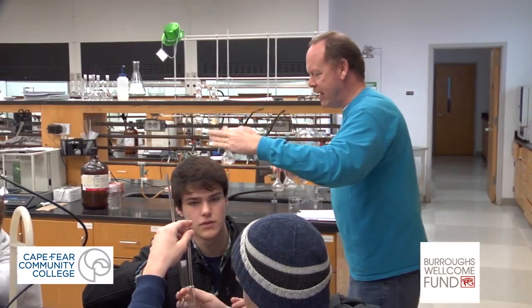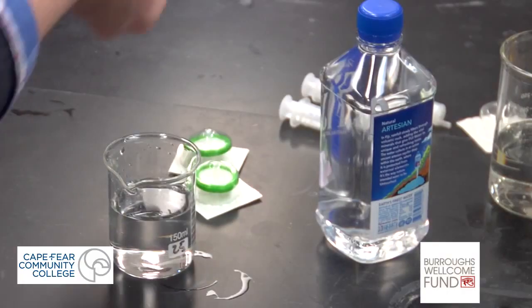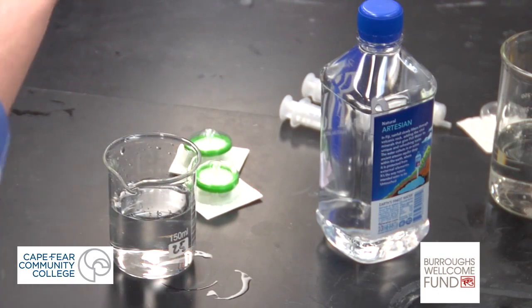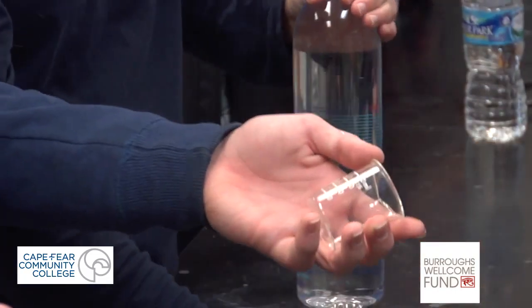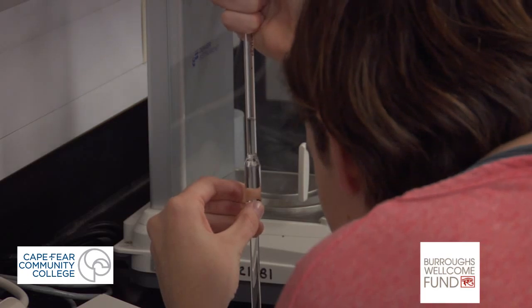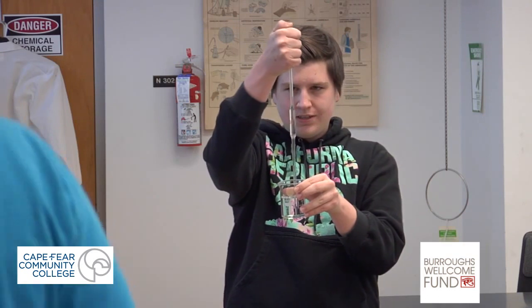So you'll pour some water in there, the same thing, you want to get to that line, that's a measurement line on the flask. Today we are trying to figure out if it is worth buying the more expensive mineral waters over the less expensive regular waters such as Deer Park and Dasani, which are less expensive than Smart Water and Fiji normally. The reason is because the Smart Water and Fiji are supposed to be mineral waters, and we're trying to figure out if those minerals are actually helping the water and if it's worth buying those kinds of waters over distilled or even just sink water.